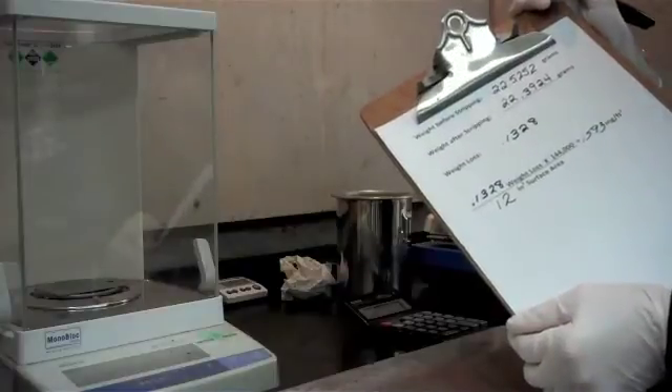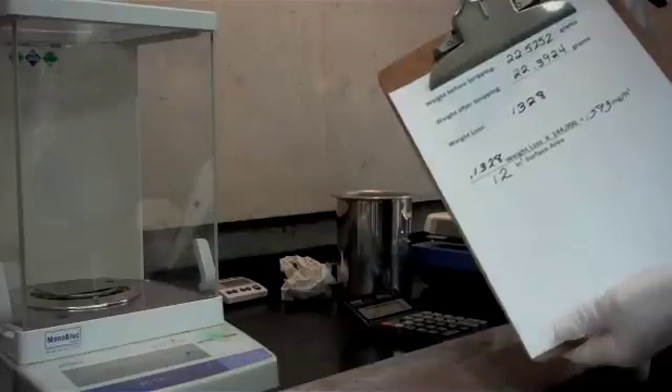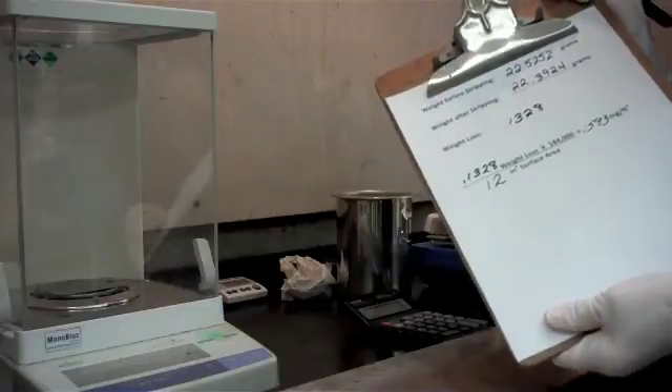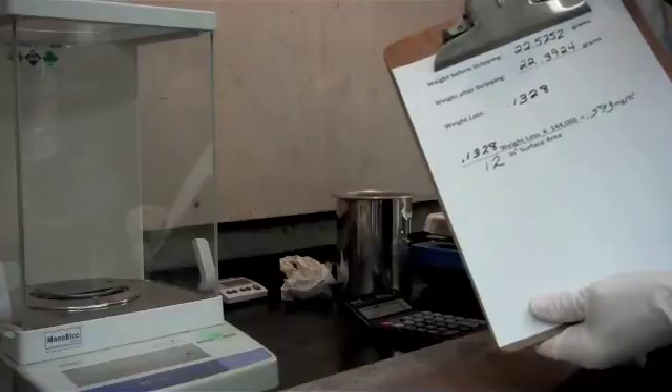It's basically a weigh, strip, re-weigh — knowing the surface area that you're trying to calculate to — and stripping in a 10% bath of chromic acid solution at 160 degrees Fahrenheit for approximately five minutes.